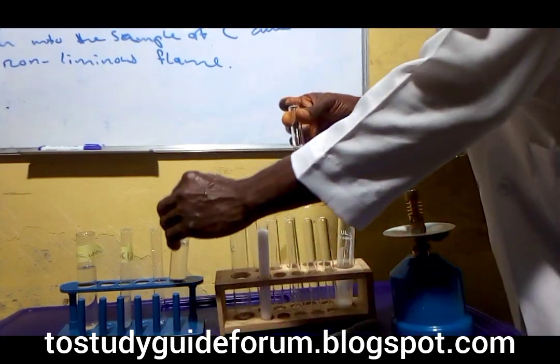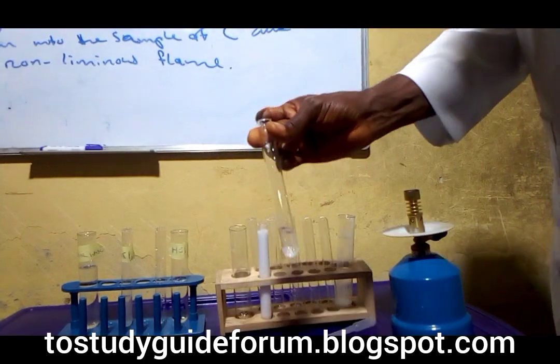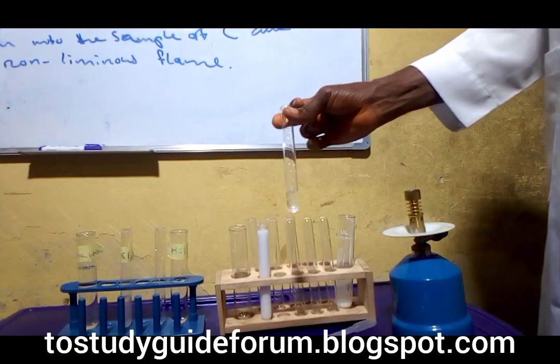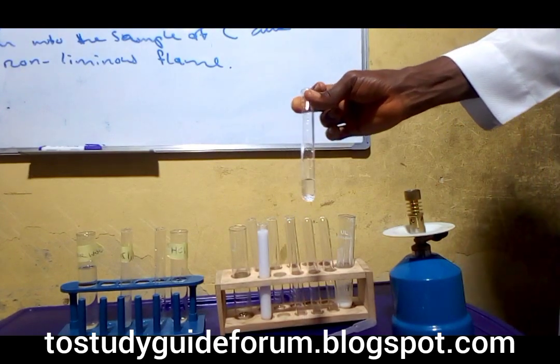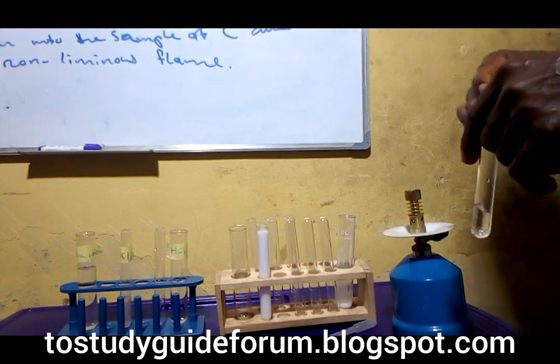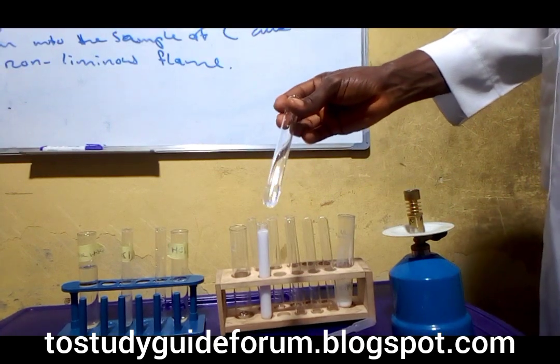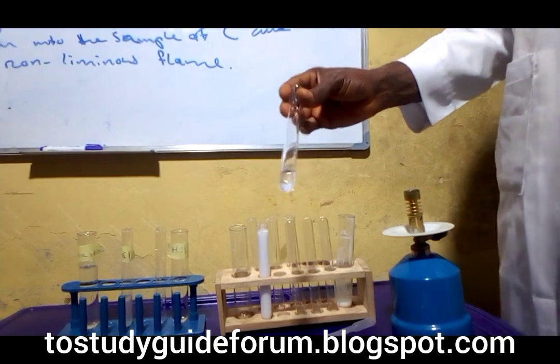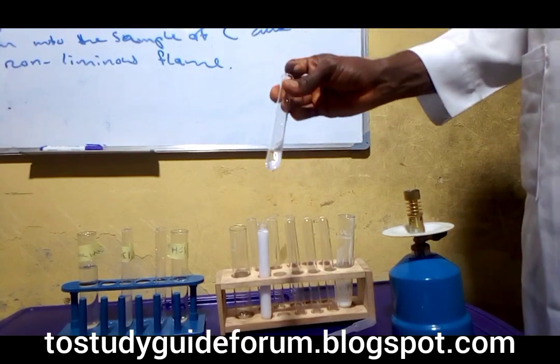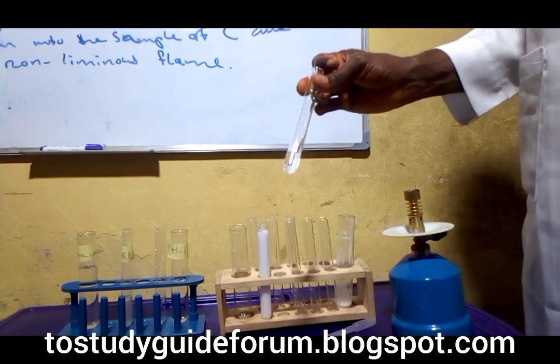Notice an effervescence occurred, and then we have a clear solution. This is a clear solution, and that means the compound is soluble. Since it's soluble, it simply means that what we are likely to have here is trioxocarbonate(IV). Trioxocarbonate(IV) is likely to be here, or trioxosulfate(IV) salt is likely to be here.